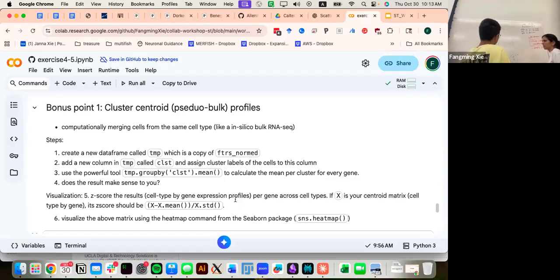Usually the centroid is always a measure, so you compute the centroid of this and of this, and the difference between the centroids is almost always a metric, either baked in or you need to provide it.